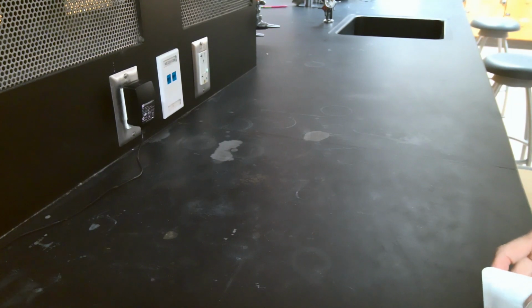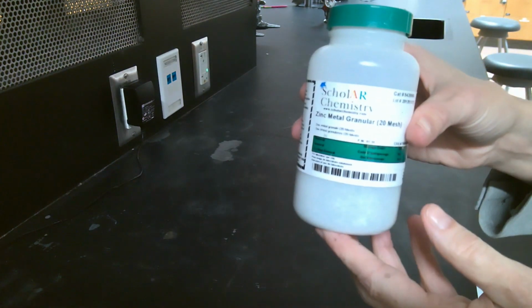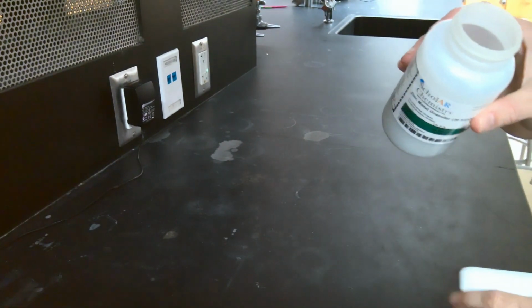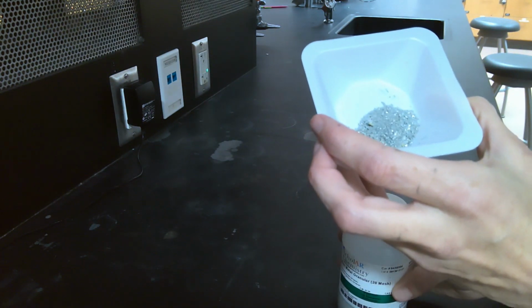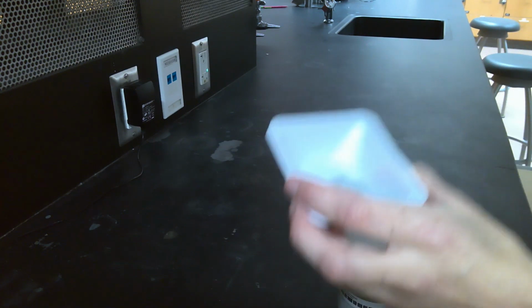I want to briefly talk about the chemicals that we're going to use in today's experiment. The first one is granular zinc. Granular zinc looks like a metal, except that it's ground relatively fine in order to accelerate the rate of the reaction. There are no safety concerns with this particular chemical.